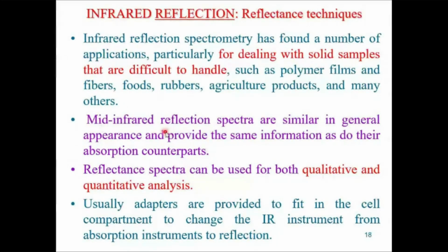Mid-IR reflection spectra are similar in general appearance to normal spectra and provide the same information as the absorption spectra. The reflectance spectra can be used in both qualitative and quantitative analysis.